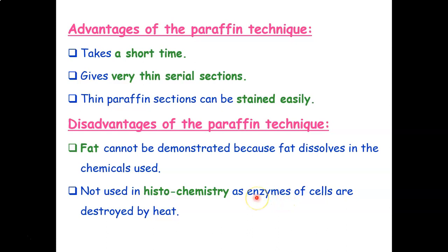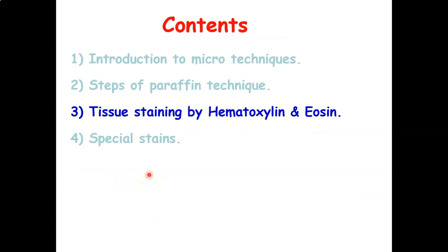The enzymes will be denatured and lose their polypeptide sequence and amino acid sequence, so I can't examine the enzymes. So these are two disadvantages of paraffin technique.